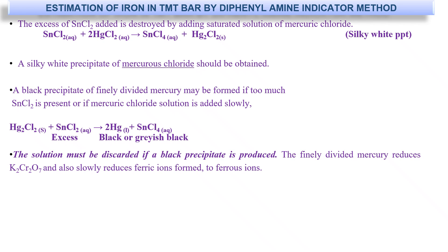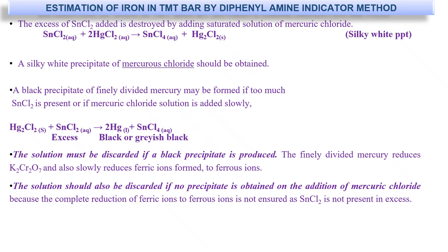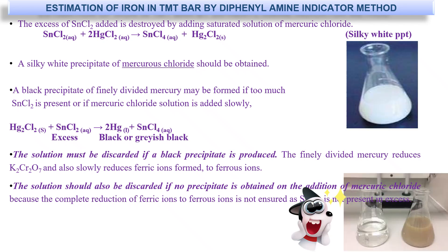We do not want this reaction to occur. The solution must be discarded if you see a black precipitate, as the finely divided mercury reduces the potassium dichromate and also reduces the ferric ions formed back to ferrous ions. Also discard the solution if you see no precipitate on the addition of mercuric chloride, because complete reduction of ferric ions to ferrous ions is not ensured.